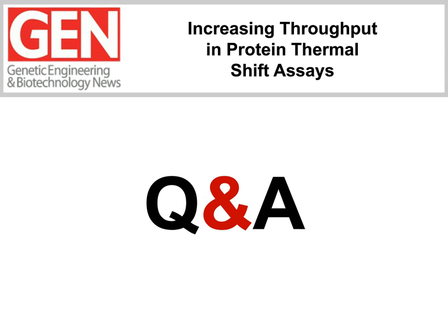All right. So someone asked, what if your sample is not a set of purified single protein, but rather different mixes? Can you still perform the assays? It is a very interesting question. I would say with the kind of software that we will be coming out with probably in the later half of the year, which has got many features in it, you can do data analysis of multiple peaks. Imagine a situation where you have a 100 kilodalton protein, right? And then, theoretically you wanted to have a 100 kilodalton protein, you purified it, but not necessarily every molecule that you have isolated out of your purification column is 100 kilodaltons.